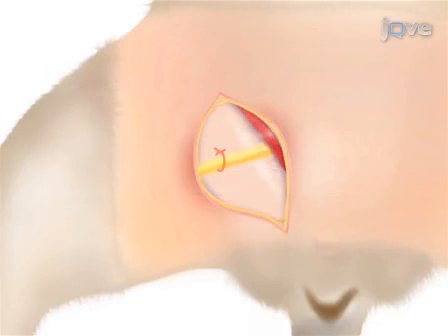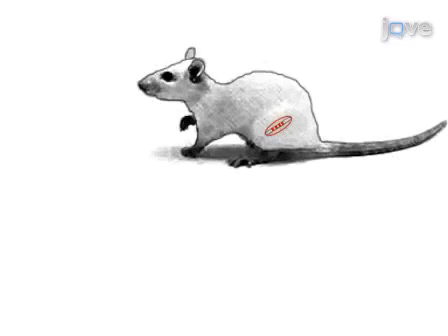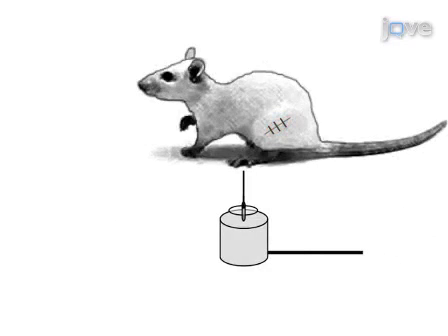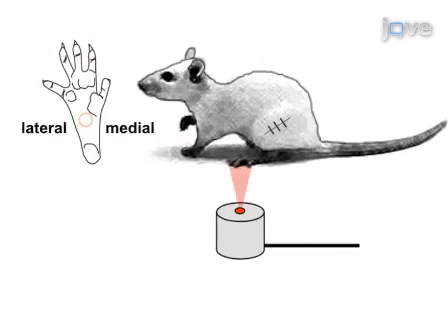This is accomplished by first placing four chromic gut ligatures around the exposed sciatic nerve at mid-thigh level to create a constriction injury. Next, monitor pain behaviors in the hind paw at desired time points by quantitatively measuring paw withdrawal threshold to mechanical stimulus using a von Frey esthesiometer and paw withdrawal latency to thermal stimulus using a plantar analgesia meter.